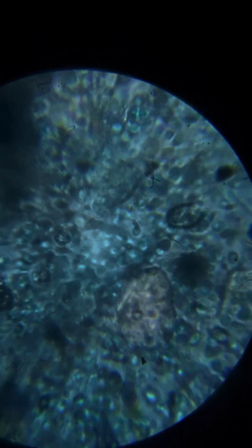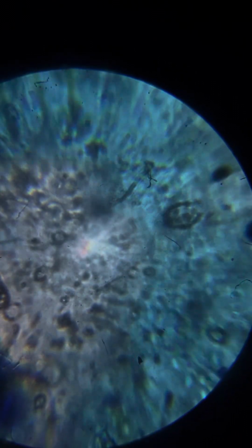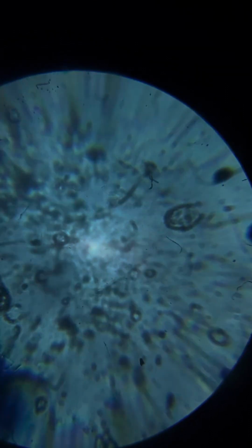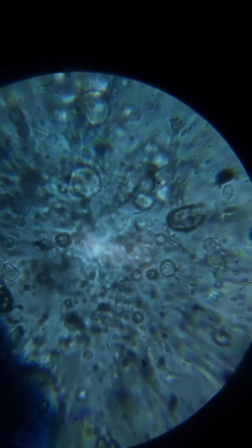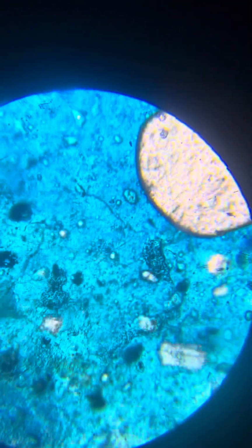So you touch the cover, they start to move. Yeah, it's very dirty, the lens, what can I say? So we see Neros here, very small ones, this is nice. Okay, impressive and better results than expected.